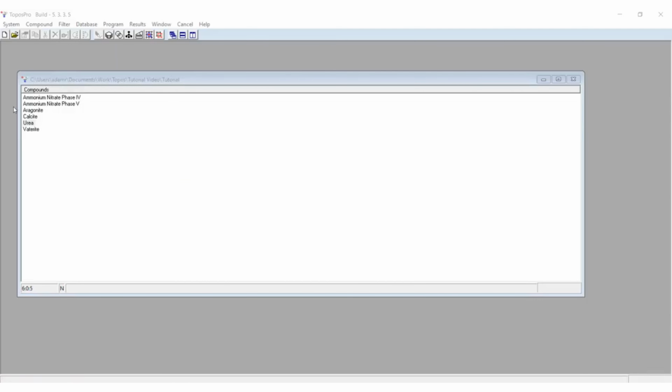So now that we've renamed our CIF files to explain what structures they represent, we can go through the process of calculating the bonding information for them. When you read in a CIF file to Topos, the bonding information is not stored, so we need to recalculate it for the intramolecular bonds, but we also need to identify the interactions to the neighbors, so intermolecular bonds like hydrogen bonds and van der Waals interactions. CrystalGrower needs these to figure out the neighboring molecules in the crystal.